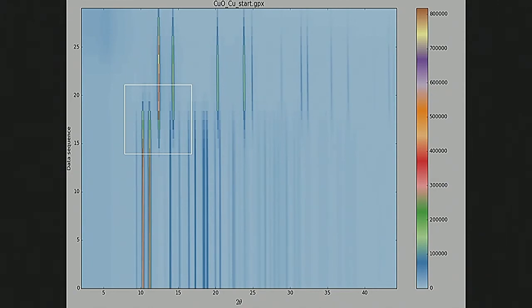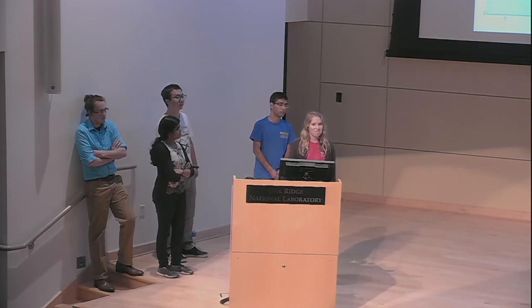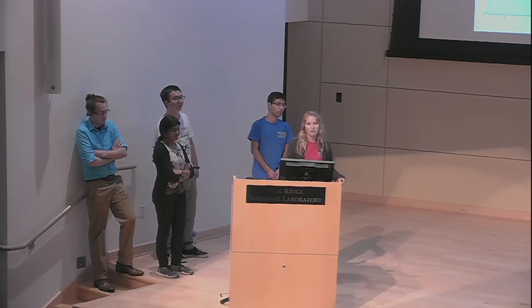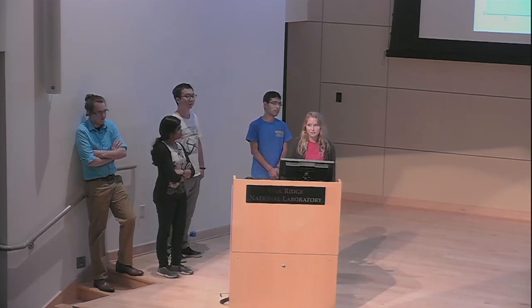You should understand that the refinement method handles overlapping peaks very well. Yes. So you can have multiple phases and refine their weight fraction very easily directly. So in that 2-phase region, you have no problem with refining how much of each phase. Yeah, it actually took us about less than 5 minutes to do the sequential refinement versus having to go through frame by frame and carry out the entire refinement for each one. So apparently GSAS is really good at this, so good software.